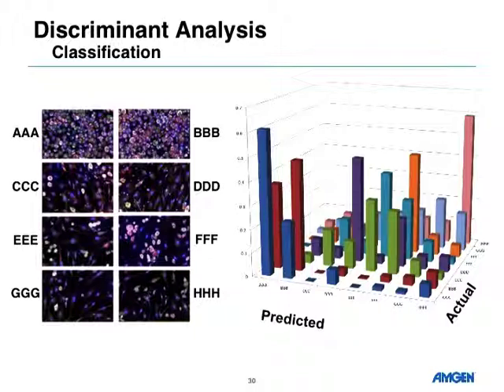You can see the different populations, some more obvious than others. It probably makes sense that, as we're using these protein libraries, you're not getting exactly uniform changes. The cells themselves are pretty different within these populations, and that's reflected in this confusion matrix over here.